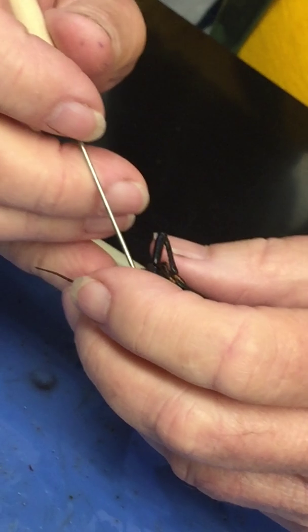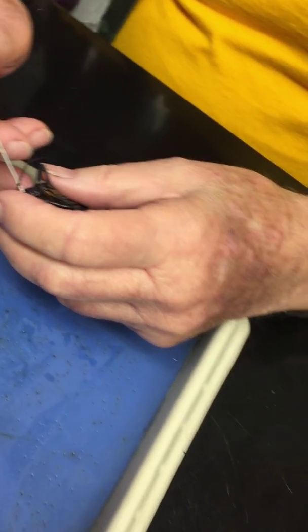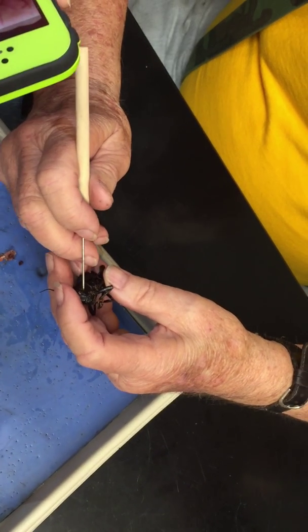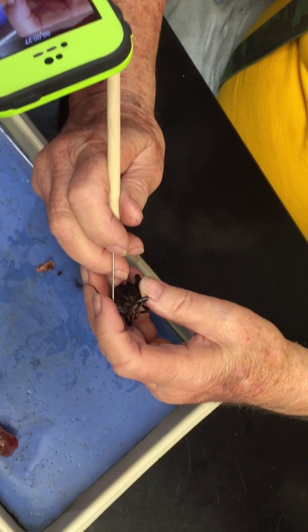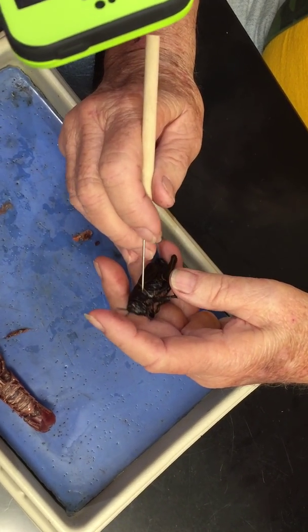I keep confusing that with rostrum. That's a compound eye. Now the ocelli. The ocelli are just light sensitive. There's one here, right in the middle of the top of the face. That's a frons. And there's another one, I think it's right here. I'll have to look that up. Yeah, they're above the compound eyes.